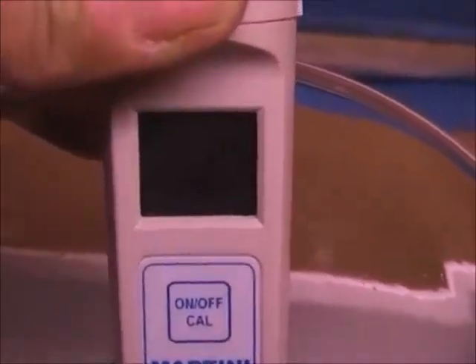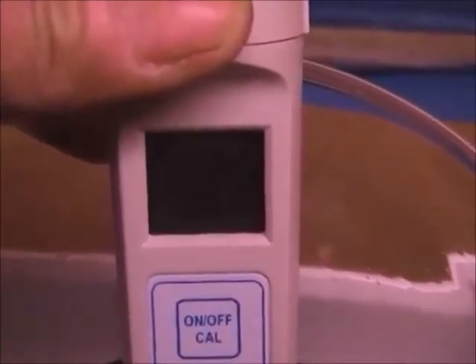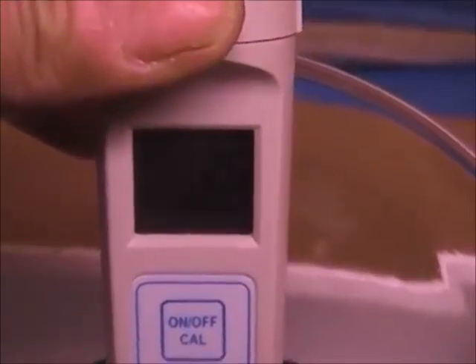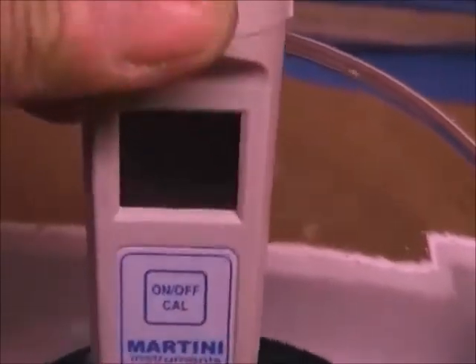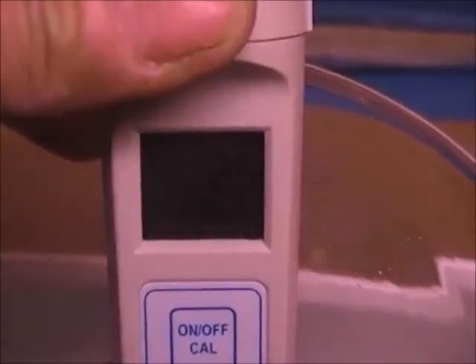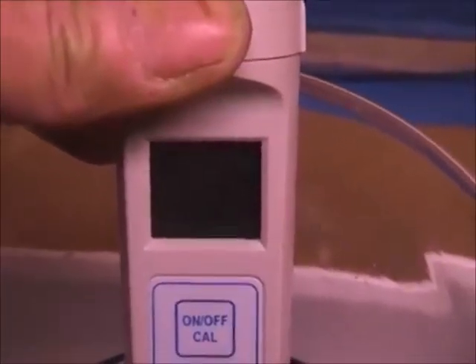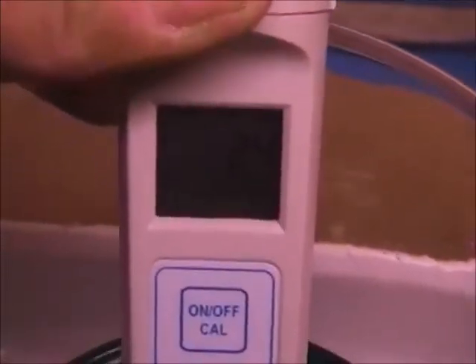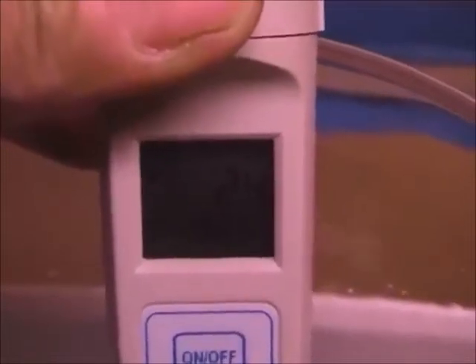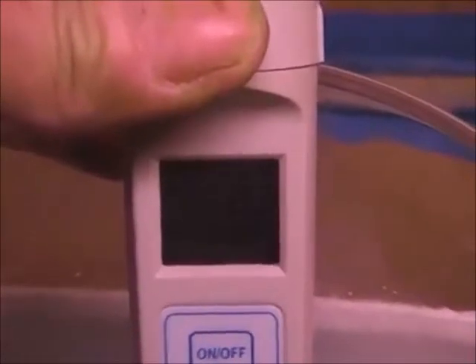And you have to give this pH meter time to adjust when you go from one solution to another like that sometimes. And it seems to be stuck at about 2.5, which will kind of give, well, 2.4. It'll start to drop after a minute. I think I was down around 2.2 a while ago. But what this will do is give us a difference between the solution pHs to observe the reaction, so we can actually learn from this.